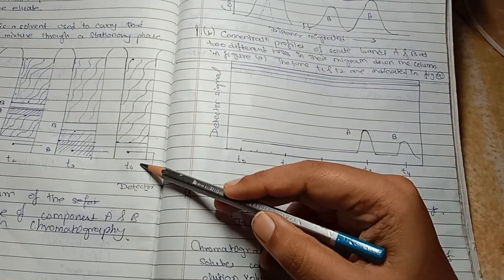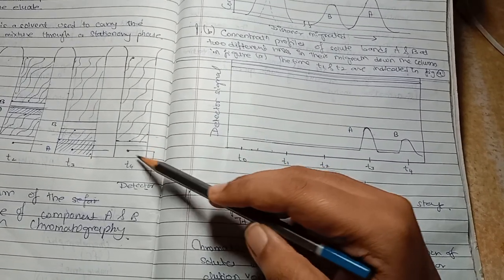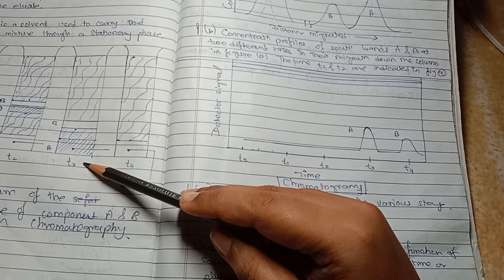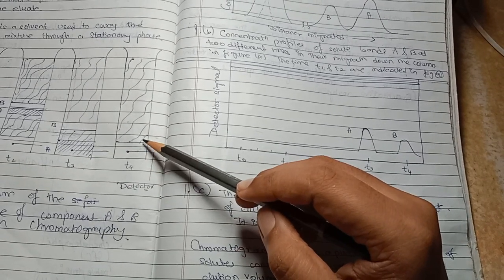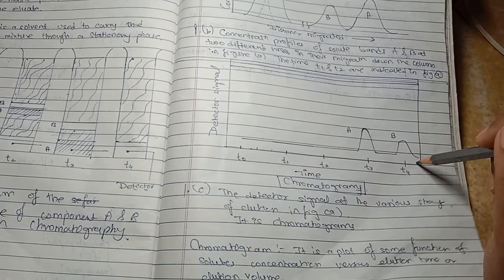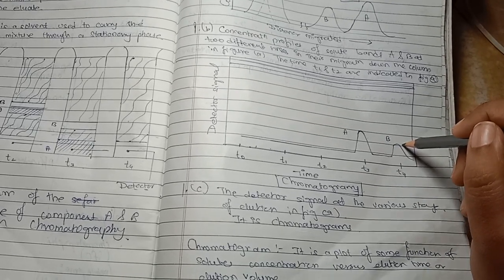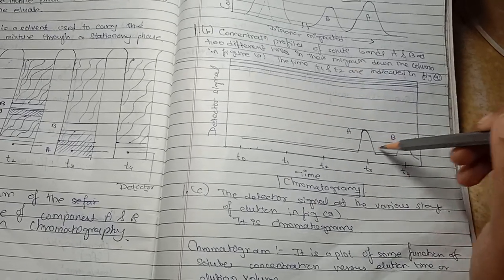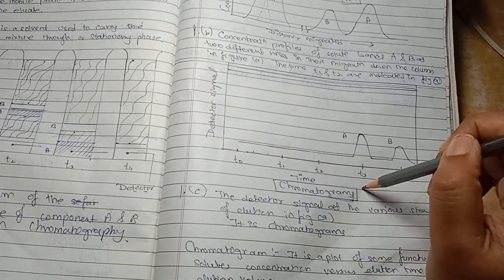Then at T4 you can see that component A is not there anymore because it had already moved out of the column at the stage of T3. At T4, which is the last stage, the component B concentration has completely moved out of the column. So this is how the mixture of components is separated in terms of time and detector signal, which is the chromatogram.